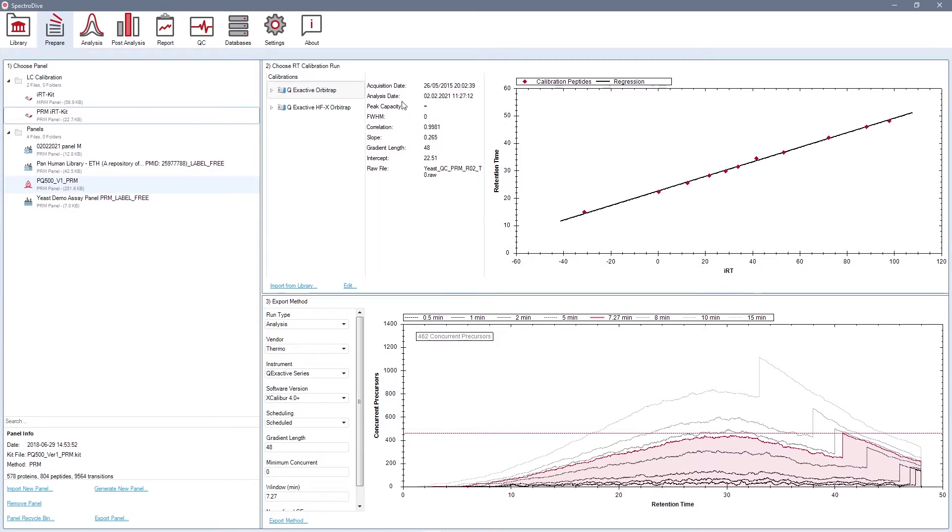Thanks to scheduling, the number of targets in one panel can be increased without compromising high accuracy of their quantification. SpectroDive gives you three options for creating a calibration run.